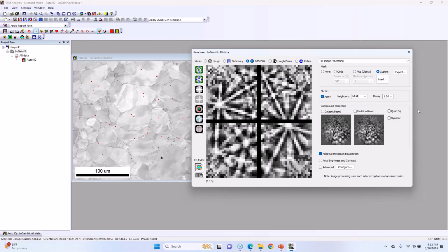Sometimes we were doing experiments where we were rotating how far away from the sample we had to be to detect the patterns, up to maybe 70 degrees away from the detector, and spherical indexing could still index these really well. But as you rotate away, half your pattern's going away, so you could mask that out to get improvement.